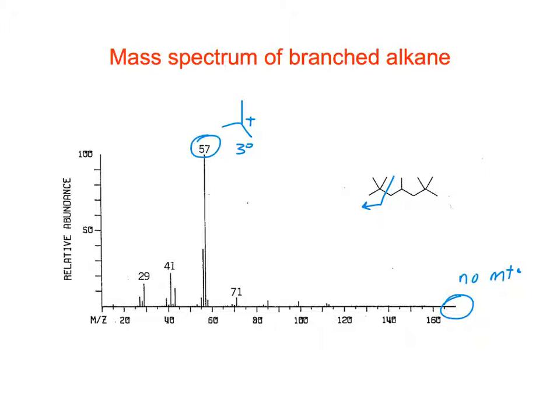And usually we won't see remote ionization and cleavage. Or two electrons could just cleave it at both tertiary positions, and you form two radicals then. Well, we'd have to form two cations, right? And I think that's a very improbable process. It is? Okay. So it would have to happen at the exact same time. Yeah, you'd have to get hit by two electrons and ionize twice, and yeah. It's gone.